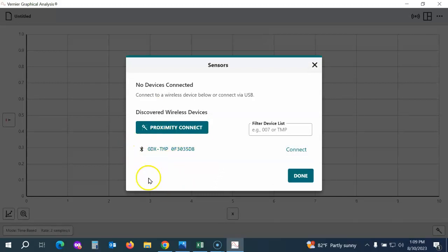You'll see a list of all the probes that are available on your screen. Because student groups will be working close to each other, they will see a whole list of available probes. To find the probe assigned to their lab group, just look on the back of the probe near the barcode and find the code that matches up on your screen. Then connect to the one that matches.